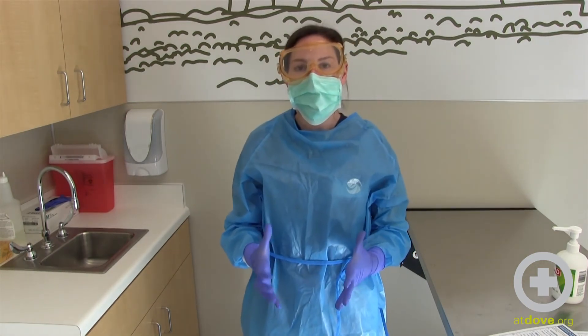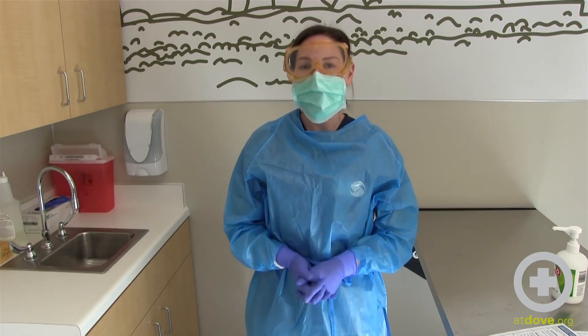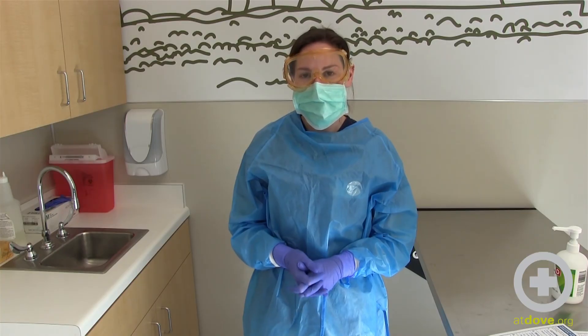And now I have my proper PPE on so I'm able to go and work with patients that may have an infectious disease, and that is how you properly put PPE on at Dove Lewis.